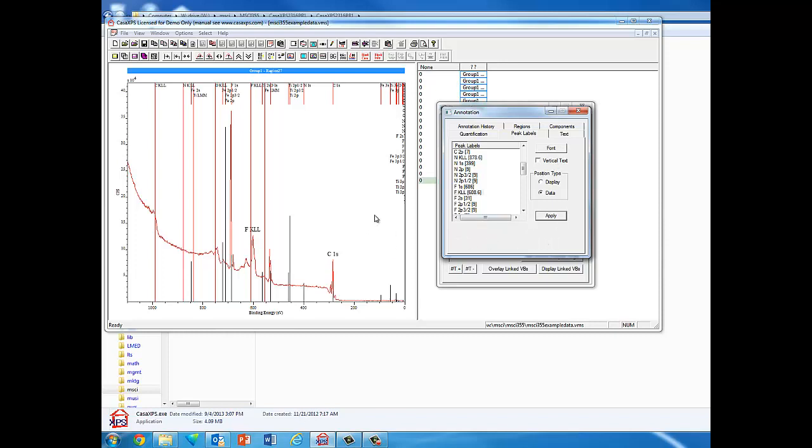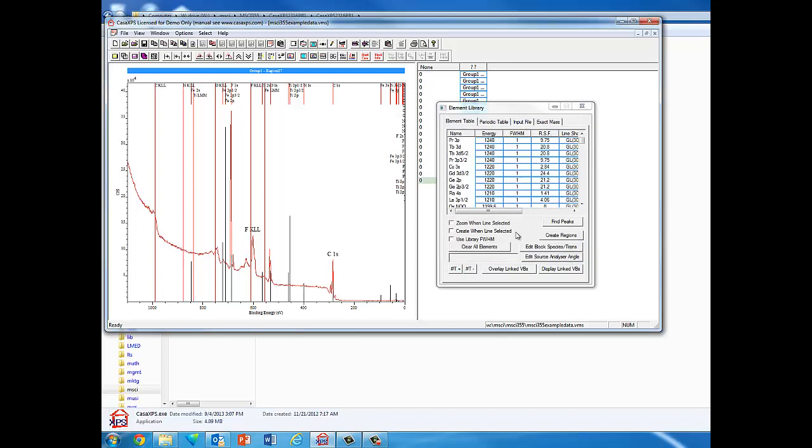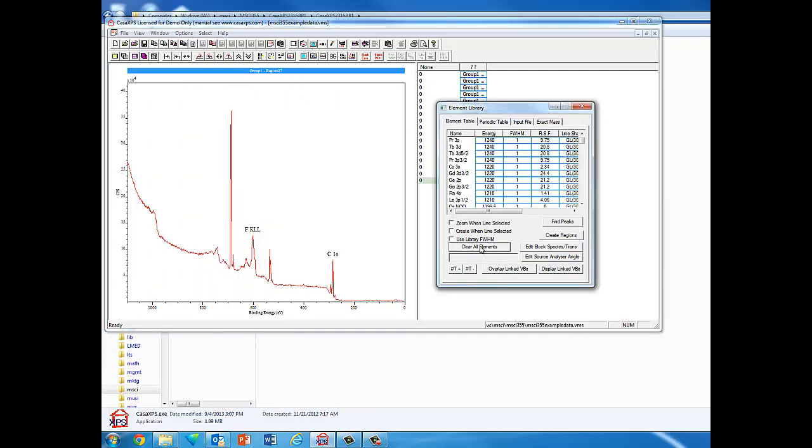Let me close this out. If I do Clear All Elements, it gets rid of all those other labels. But you could go through here and label each of these peaks, which makes it a little better and easier to read than all the different lines that were there in the program itself.